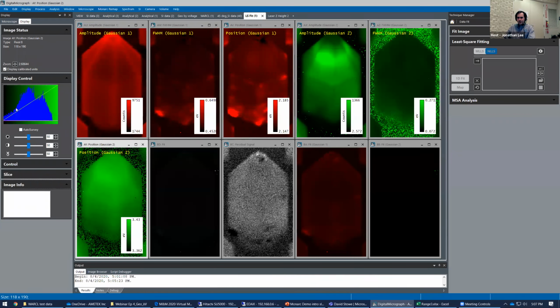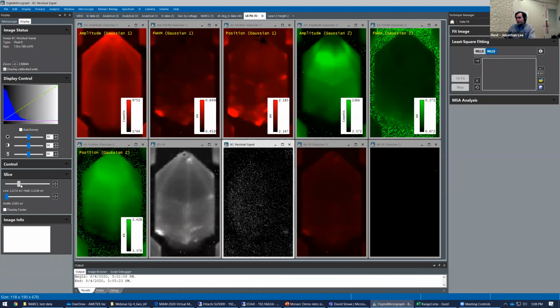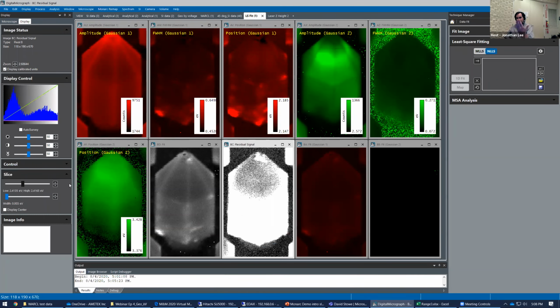The default contrast options weren't ideal. So the residual and the fits are spectrum images themselves, meaning that it's not a spectrum, but this stack of information. So there's a three-dimensional stack of information there, and I can look at it.